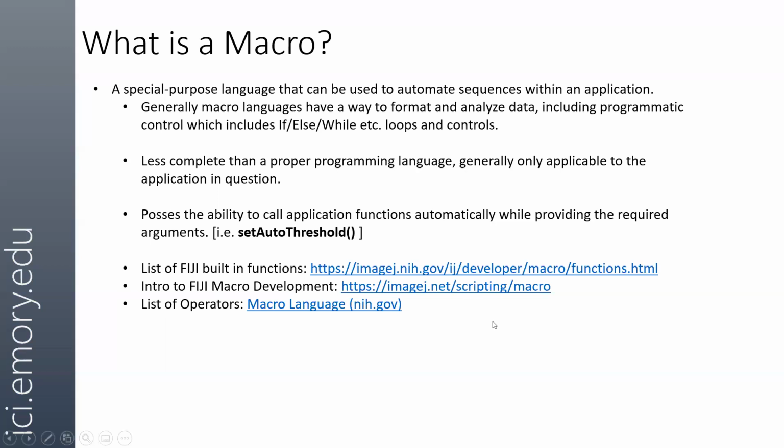The links here are to several great web pages that show the built-in macro functions, show what the different operators do, and provide guides on macro development. So normally they're a good resource if you have some questions in the process. If you need to remind yourself on something, do check out those websites. They're very good references.